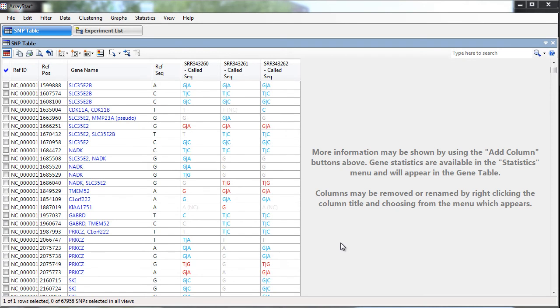When all of these steps are complete, you are able to see an ArrayStar table without any of these blank cells we originally saw. We can now make SNP comparisons between the sets.